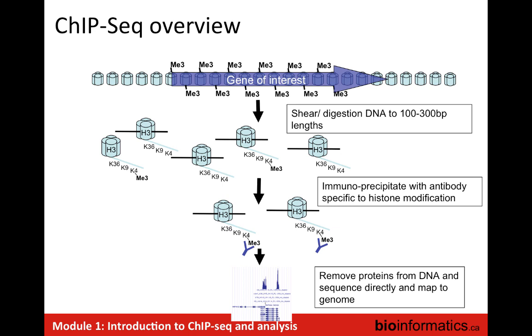Or we use something called MNase, micrococcal nuclease, that can digest in between nucleosome structures. And there are advantages and disadvantages to each of those technologies. Let me just say that for those of you who are interested in studying very small numbers of cells, so in the order of 10,000, 100,000 cells, MNase-digested chromatin ChIP-sequencing is the way to go, because then you're not dealing with DNA damage associated with cross-linking, and we and many others have published papers that allow that. And in fact, as I think some of you are aware, even Bradley Bernstein's group has gone down to single cells, and I'm happy to discuss that as we go through. But two basic ways, digestion and shearing, and there are combinations, so some people have done cross-linking and shearing, and there are advantages and disadvantages to each in terms of the downstream applications.